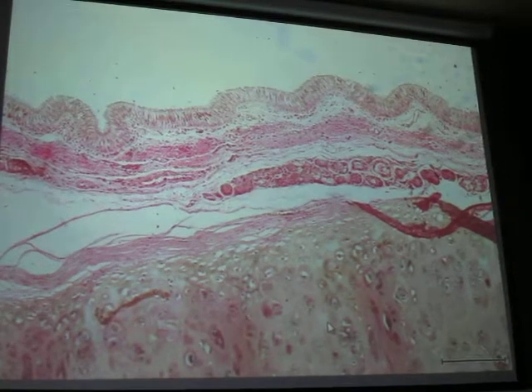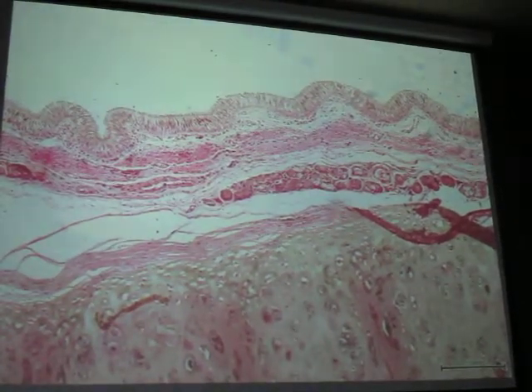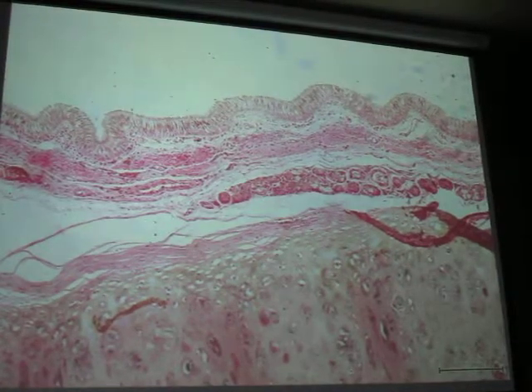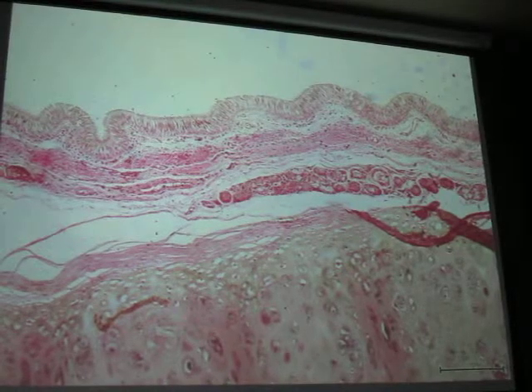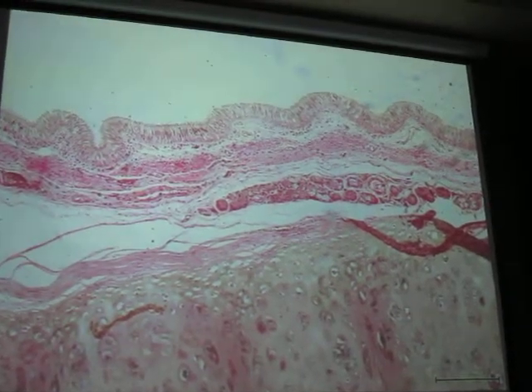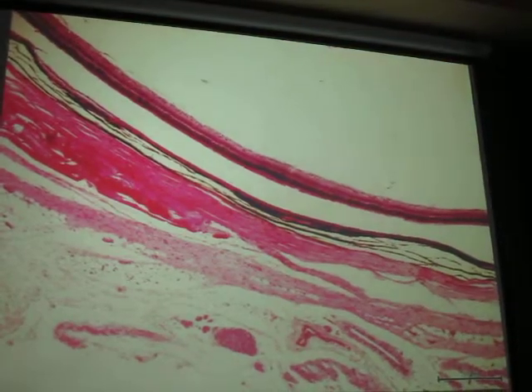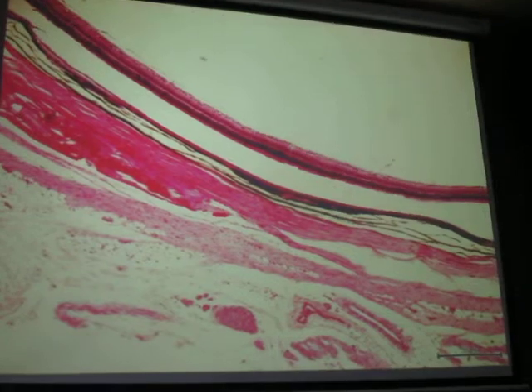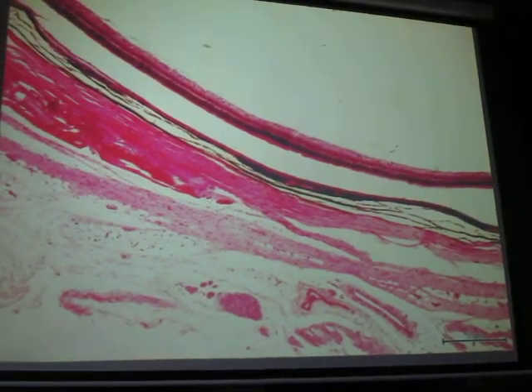Can we already answer respiratory epithelium? If the question is identify, it's respiratory epithelium. If classify, pseudostratified ciliated columnar with goblet. Let's see. Can you identify the whole organ?